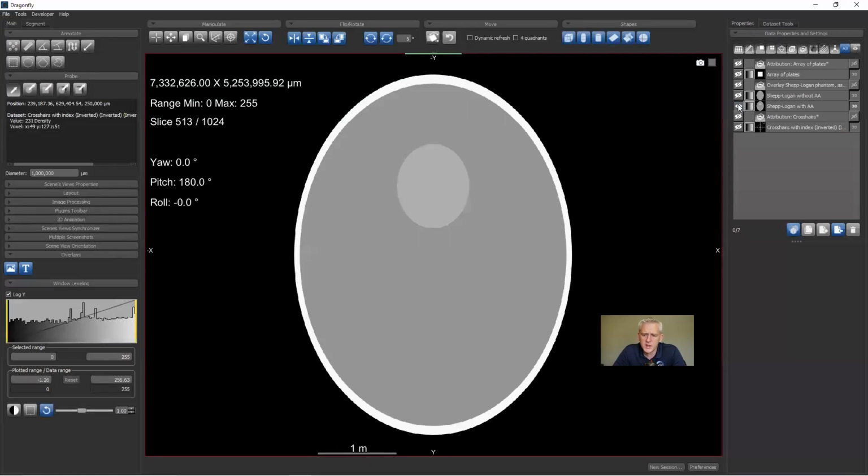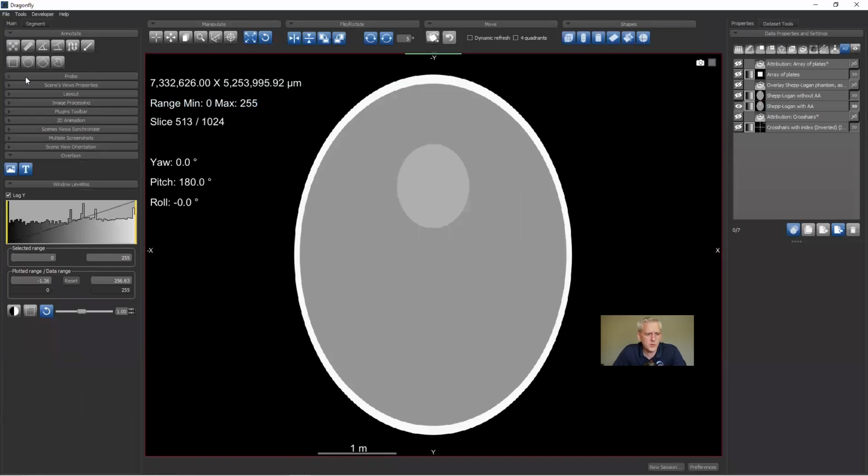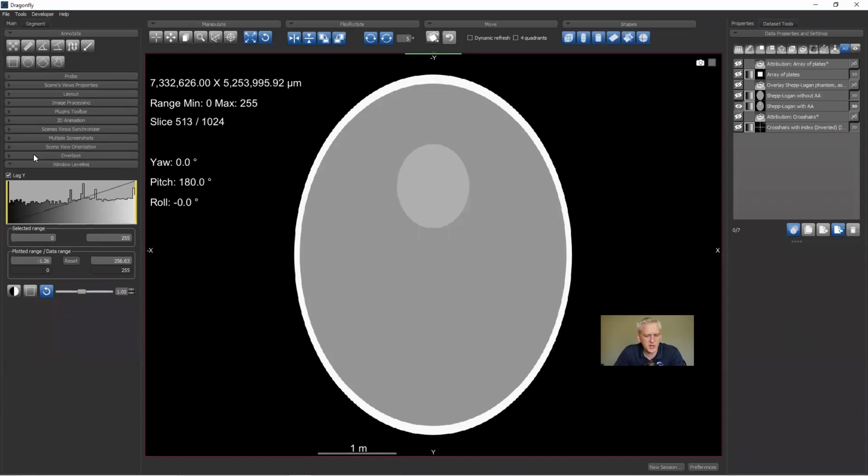So I want to look at this image for a second, and we will discuss clip and crop and resample. If we look at this particular image, I want to point out some details because we're going to introduce some interpolation with resampling at some point in this lesson, and you're going to need to understand when that helps you or when that hurts you, or what the trade-offs are when you introduce resampling or interpolation because of your resampling operation.